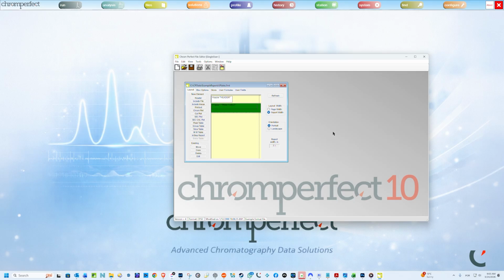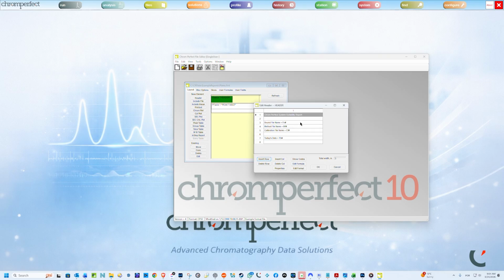These sections may include headers, peak result tables, as well as group and slice tables. You can also include graphics and image files, different types of Chromperfect plots, as well as more advanced options such as size exclusion chromatography, molecular weight reporting, and in-step reports. These advanced options will not be covered in this series, but you should be aware that they exist. Each section controls both what information is shown and how it is arranged.